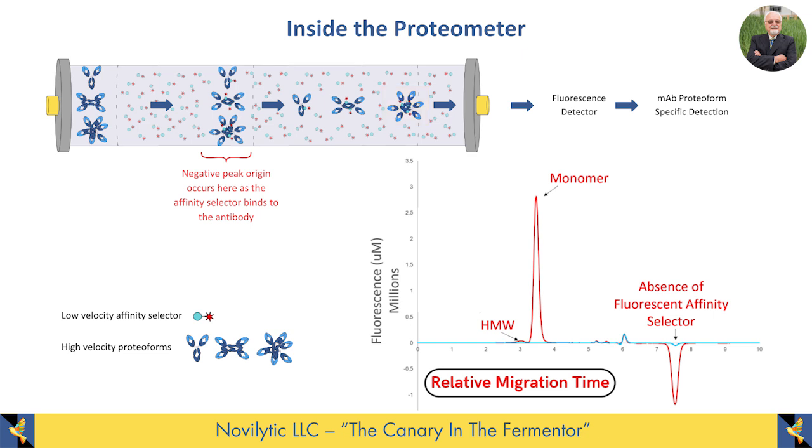So that's how we use this molecular recognition thing right here to be able to separate molecules over here that you can then quantify and know the relative amount. Now, why do you want to know this? Well, this is the therapeutic form.